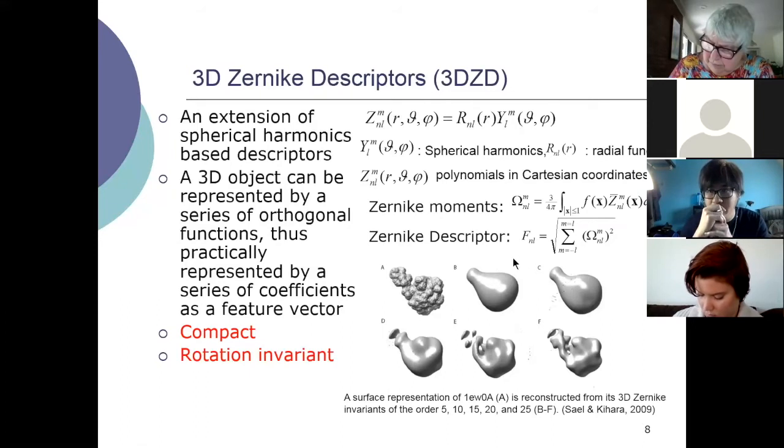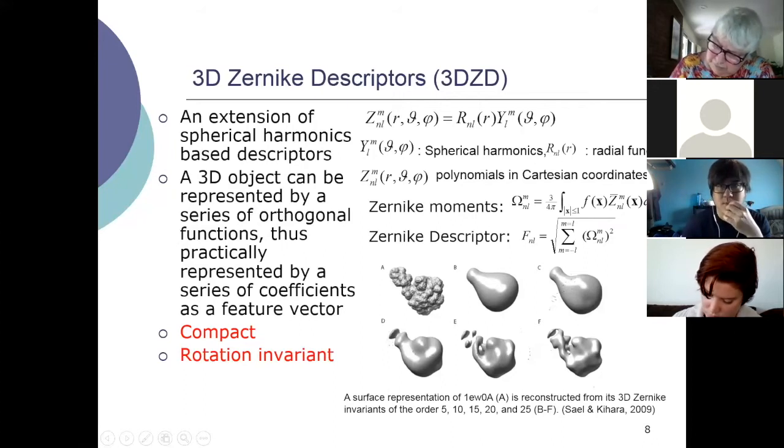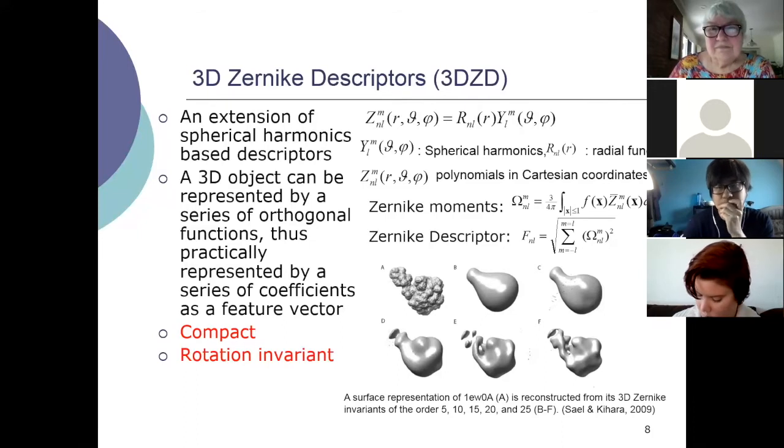For protein docking, we used a little bit lower n because we also want to consider the conformational change upon docking, because the bound form and unbound form of a protein differ a little bit, at least, or drastically. So we wanted to consider the surface as a kind of soft surface. I see.